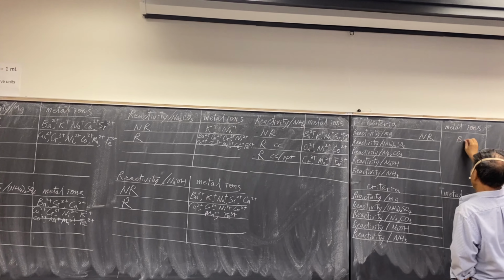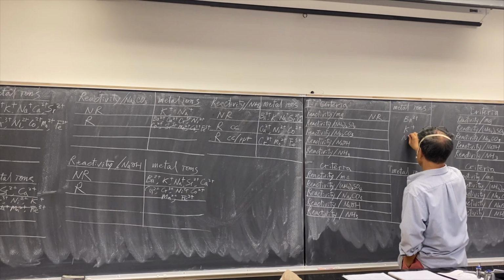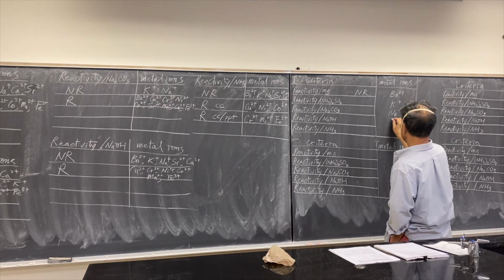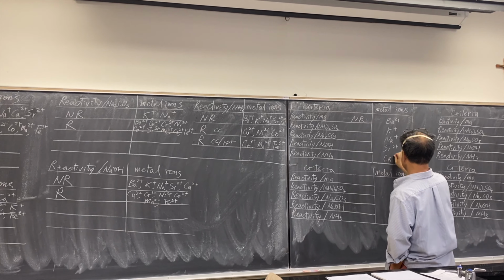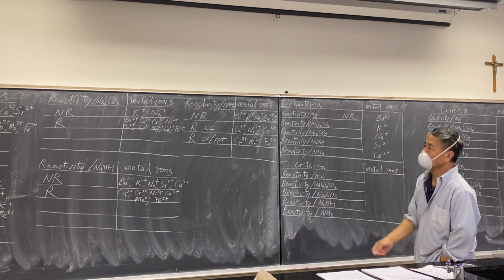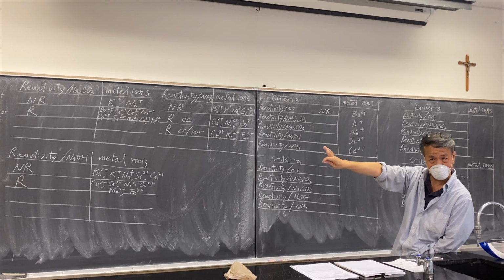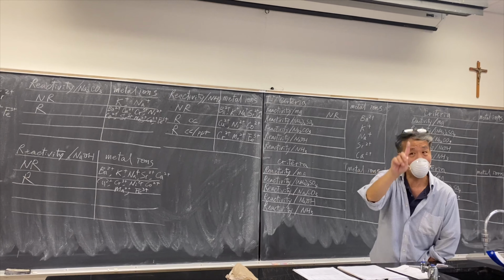Well, barium, potassium, sodium, strontium, and calcium. Beautiful. Remember, we haven't finished our first reactivity yet, so don't move to the next one. You go to the next table.